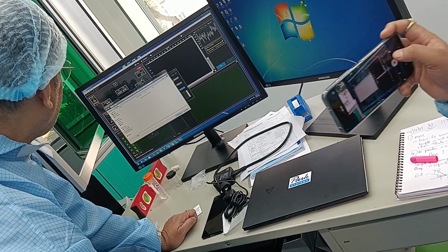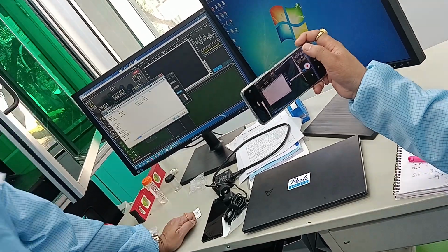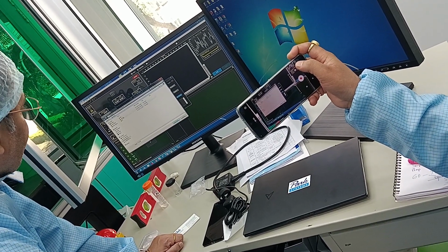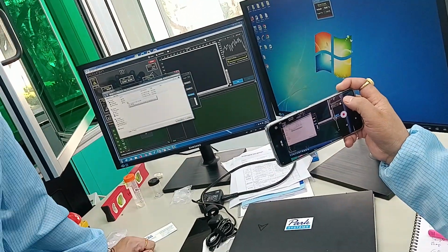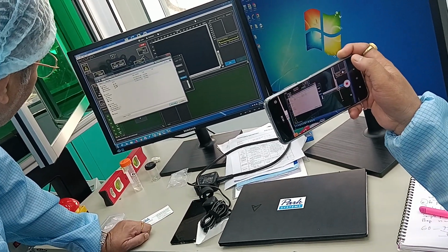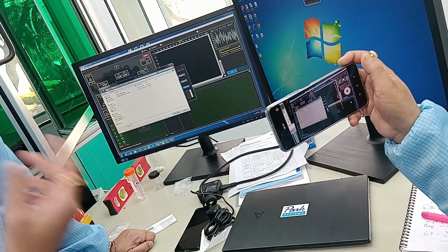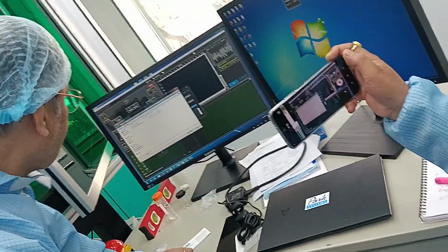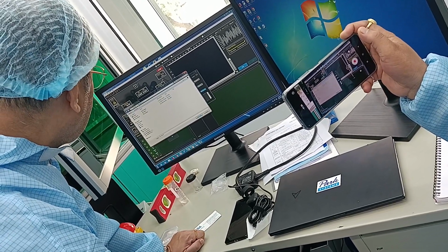For example, here I am in others, whereas you can come here to user data, E and IIT Mandi, depending on which area you are in, under Satinder sir or someone else. Select that module and create your folder. For example, someone is in SCEE under Satinder sir. Click here and then create your own folder. You are the username, so create the folder, and then you say I am going to do here and select the folder. So I go back, I go to others.